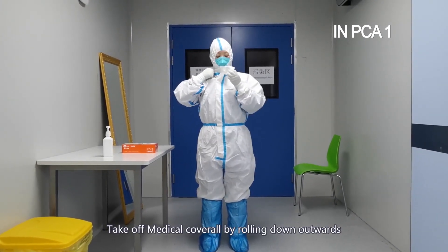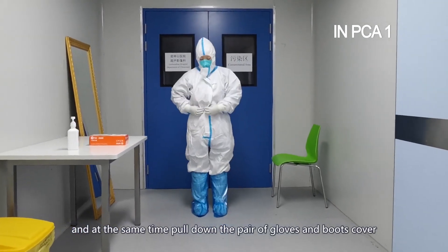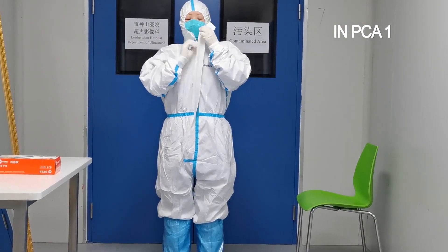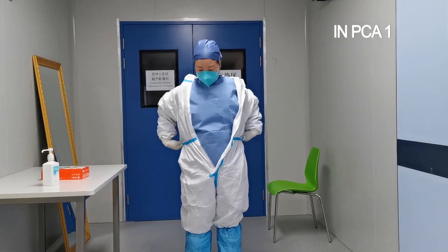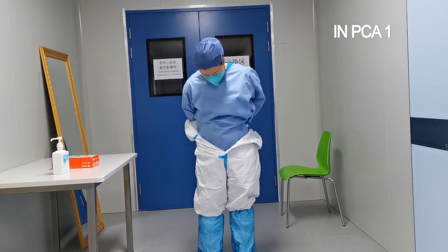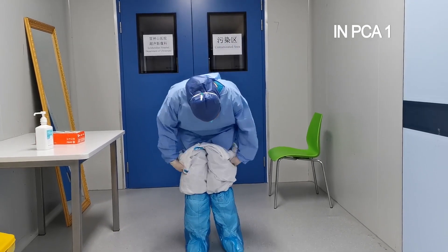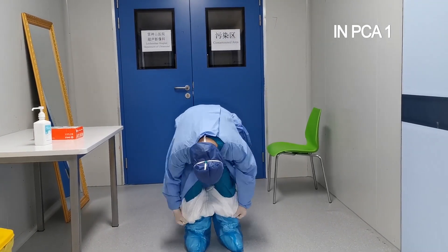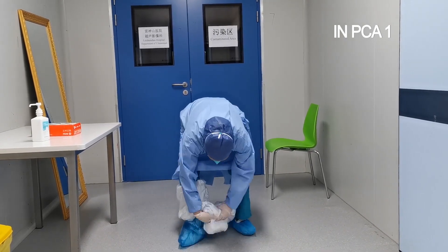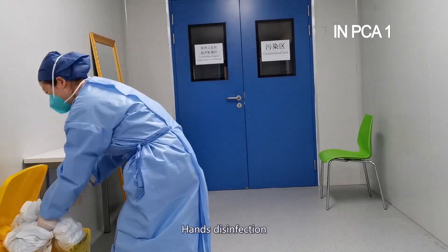Take off the medical cover by rolling down outward. At the same time, pull down the pair of gloves and the boots cover. Hands disinfection.